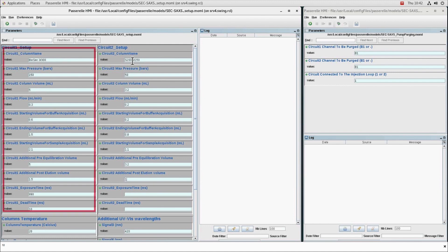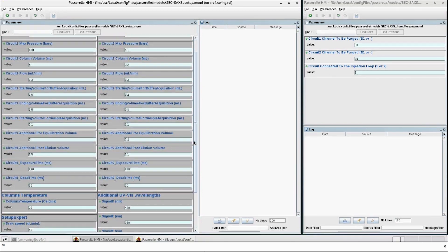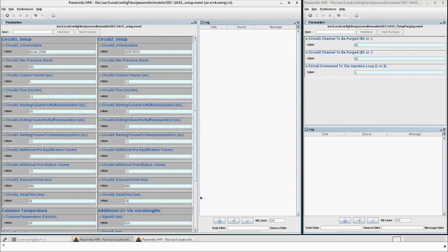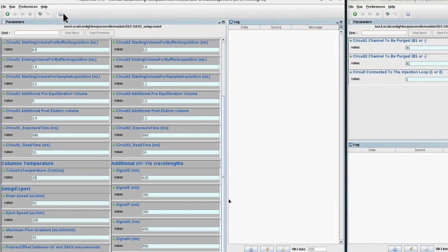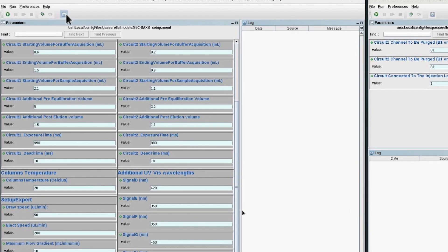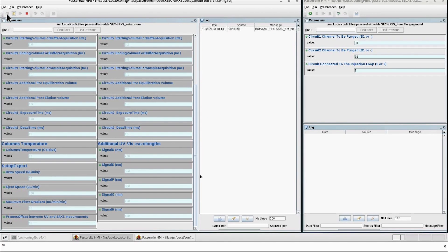Any additional information such as UV wavelengths to be sampled and column temperature can also be added. When all parameters have been set, save the values and execute the workflow.